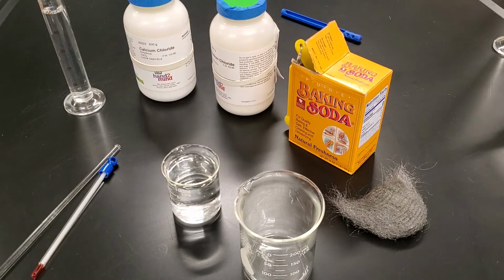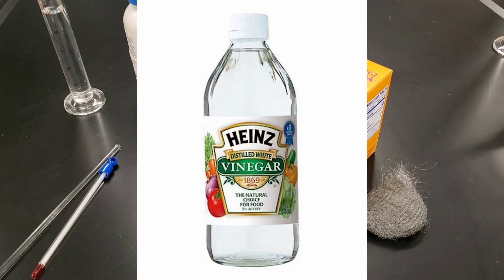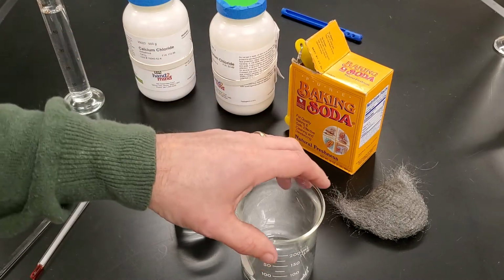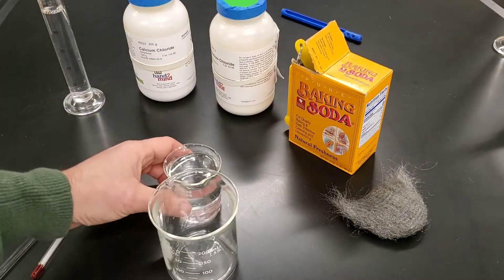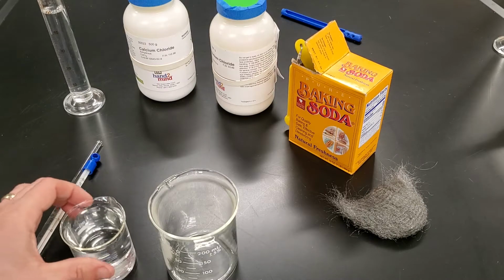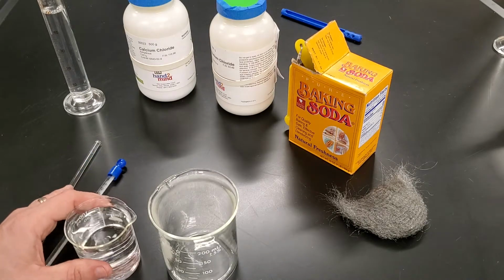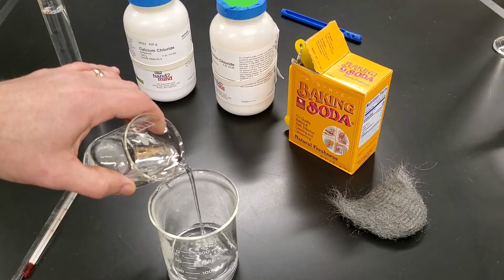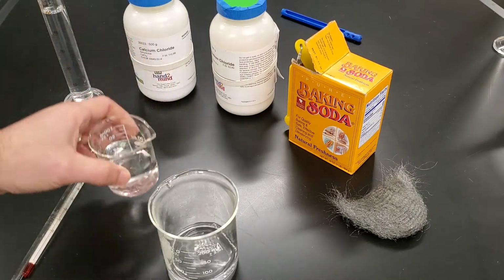So for step one, we're going to get the liquid component, which happens to be vinegar for our first one, and a solid component, which is the piece of steel wool. We're going to take 50 milliliters of the vinegar and pour it into our much bigger beaker. So here's our bigger beaker. This is my vinegar, and I'm going to pour in 50 milliliters. To about right there.